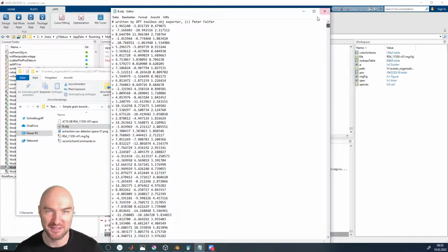Mind you, this is a text file, so if you want to export 20 million atoms in a text file, that's maybe not a good idea. But usually if you want to outline some interface, you're going to have a couple of 100,000 atoms max, maybe a million or two. Storage these days is cheap, and if you really think it's too big a file, then you just delete it afterwards, because it's extremely easy to create.